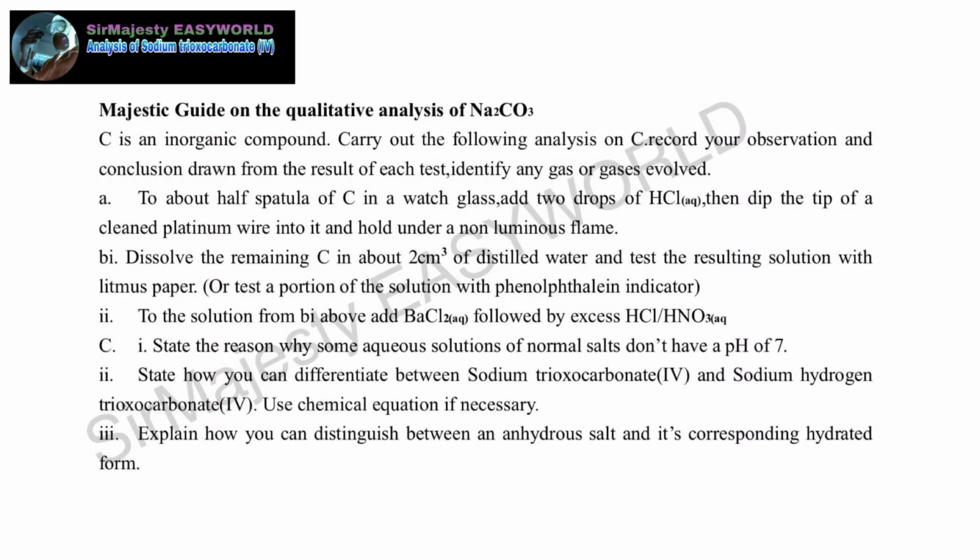Other common colors: copper will give you the green flame, potassium will give you lilac or lavender color, calcium gives brick red, orange red. So there are many other colors. For sodium, it gives us golden yellow.